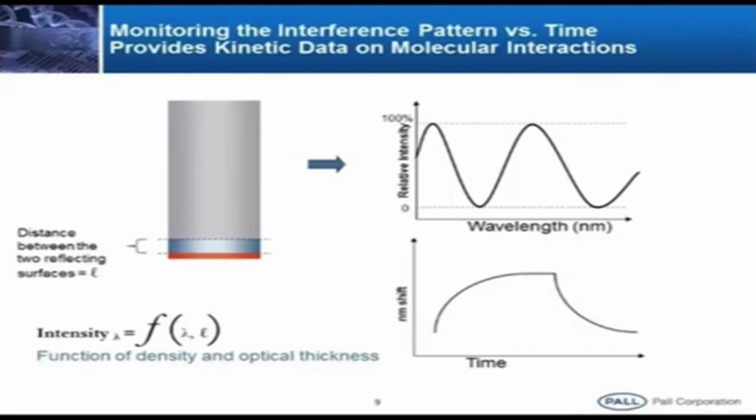Now, it starts dropping in the dissociation phase. If it looks like this, we call it a moderate interaction. If it is a strong interaction, like a straight line from here, we call it a picomolar affinity. What exactly is picomolar affinity, nanomolar affinity or micromolar affinity?